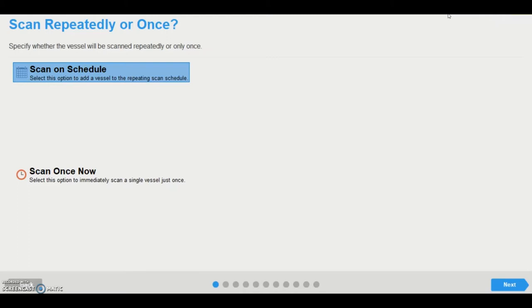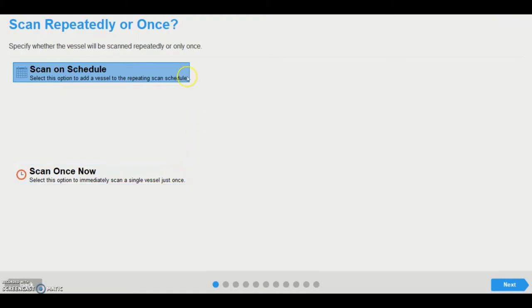Initially, there are two options available to set up a scan. Scan on Schedule, which creates a user-defined repeating schedule, or Scan Once Now, which immediately initiates a single one-off scan. Double-click on the scan type, or click Next to proceed to the Create or Restore Vessel page.